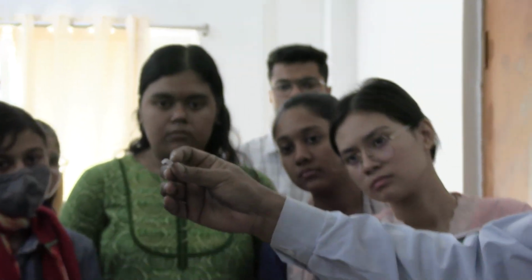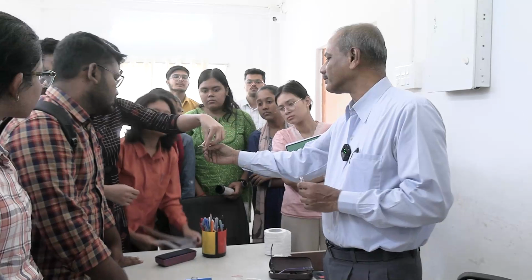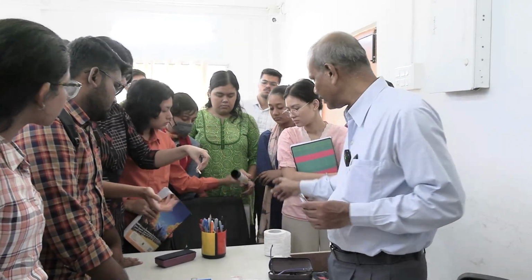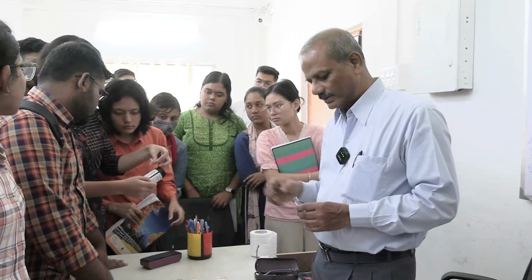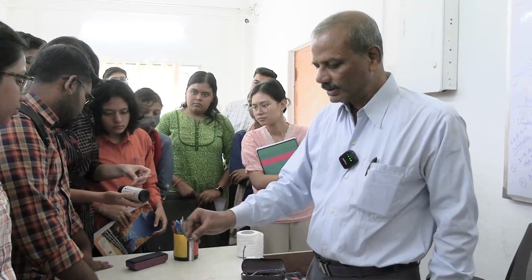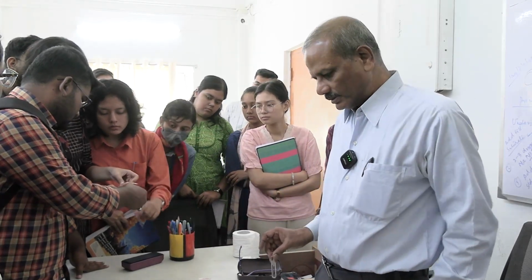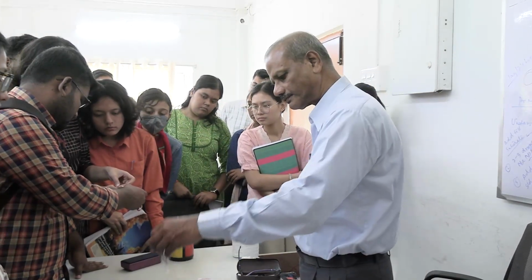So exactly at 30 seconds you have to note it down. Hold it, hold it. See the last one. The color by this time has changed. Now you match it, where the color matcher is there, match it. So these I have given a little high concentration to show you the spectrum of changes. You got it?